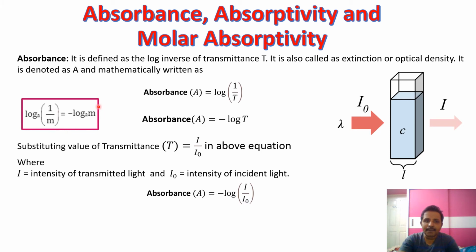Again using the same formula, we get absorbance equal to log I naught by I. This is how we get this formula, using the equation log 1 by m equal to minus log m. Okay.